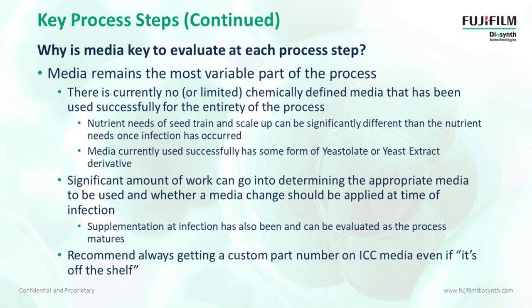Most of the media currently has some sort of yeast hydrolysate or yeast extract, and anyone who's had to use those knows exactly how variable those can be. And one thing, we do have a commercial process that we've been running for 15 years, and you can definitely see a little bit of difference due to those components over that full 15-year life cycle of the process. So that's just something to keep in mind and keep management on throughout the life cycle of your project.